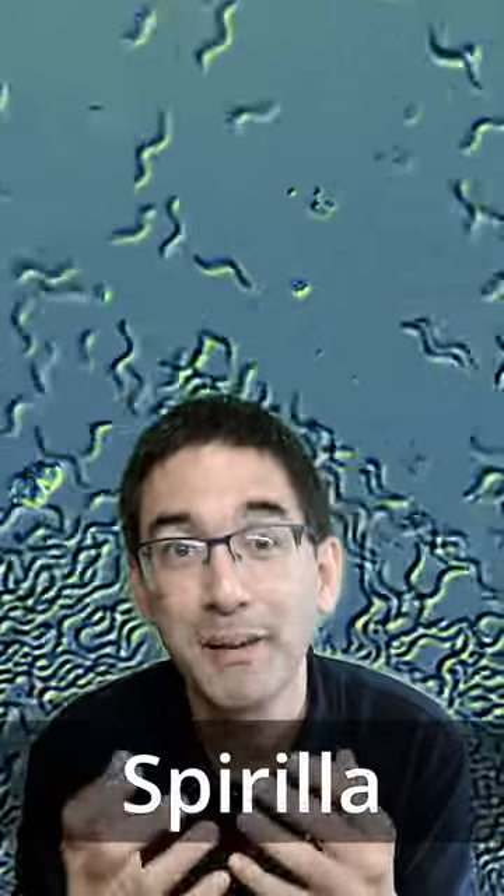These here are Spirilla. Spirilla are spiral-shaped bacteria that move by turning like a corkscrew, found in a water sample that I have sitting around.